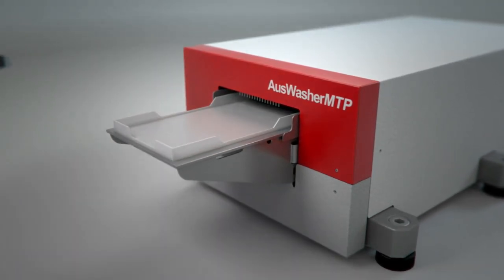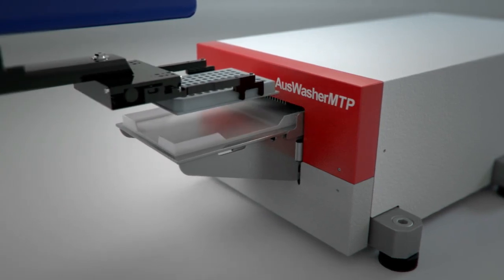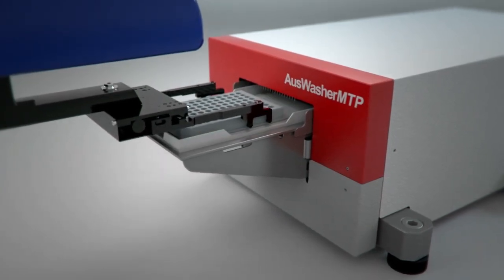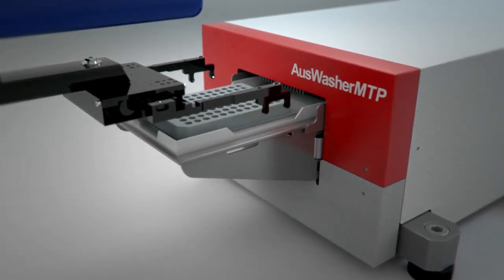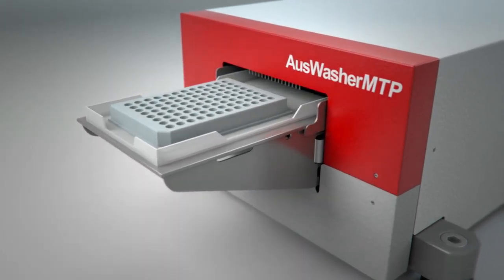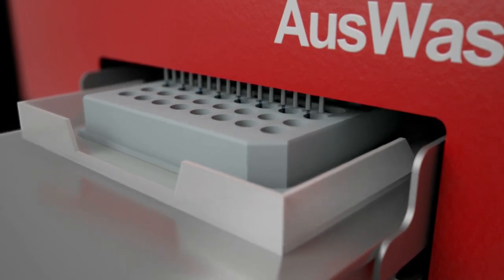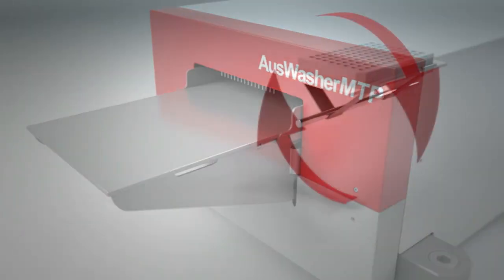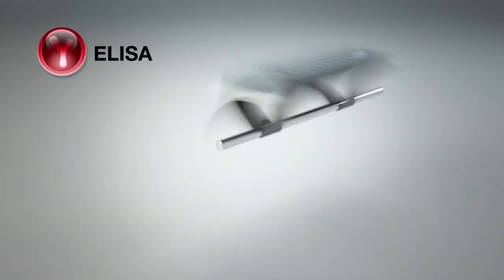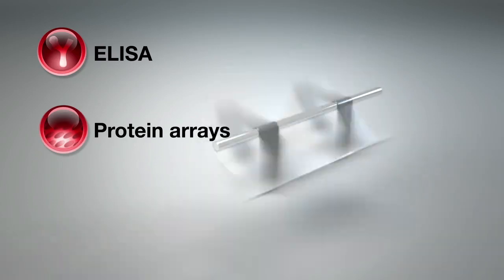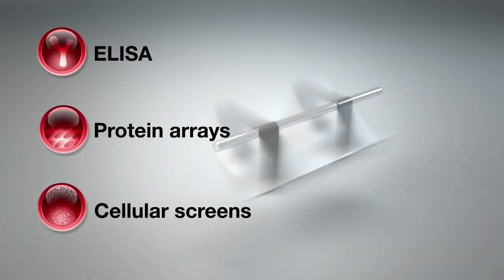Oz Washer is the first instrument to use centrifugation instead of aspiration to remove liquids from plates. Unlike conventional centrifuges, the Oz Washer features a horizontal axis. Whether you are running standard ELISA, multiplex protein arrays, or high-throughput cellular screens, Oz Washer brings unique benefits.